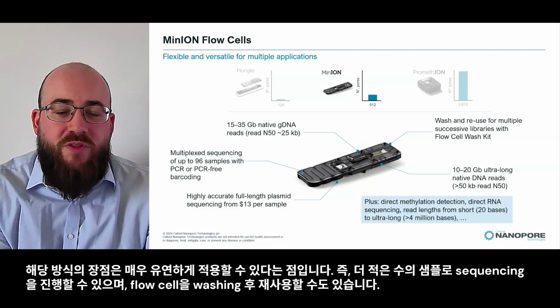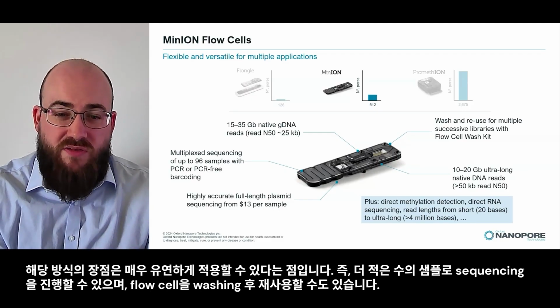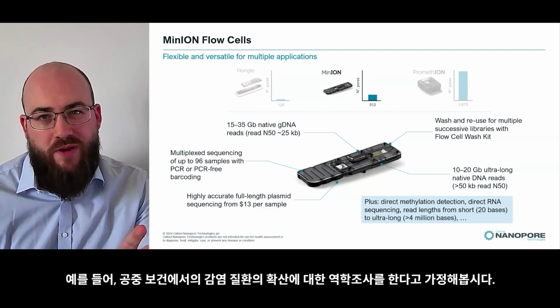Now, the really flexible thing about this is that we can run less, but we can also wash and reuse them. Let's take an example of a public health application, outbreak tracking.